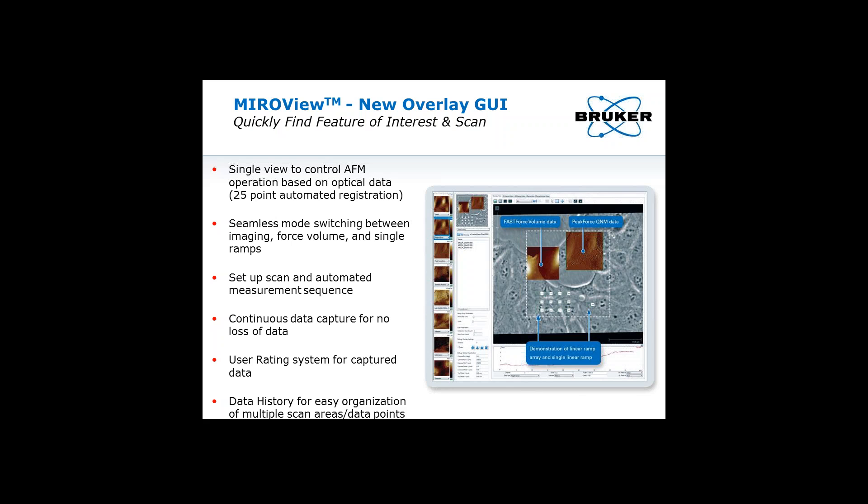The Resolve software now automatically captures all data, so there's no need to remember to click a capture button. To manage the volume of data, two new features are included: a three-star user rating system allowing quick sorting of important data, and a data history feature. When a user selects a single area in MRO view where data was collected, all associated data files are listed separately from the general browse view. Users can then open, view, and process these images knowing exactly where they were obtained on the sample surface in direct correlation to the optical image.